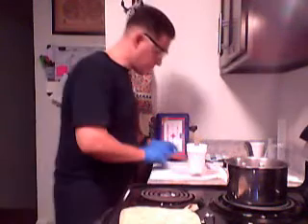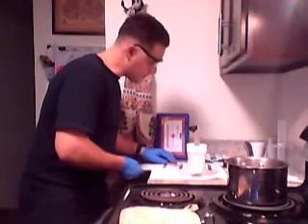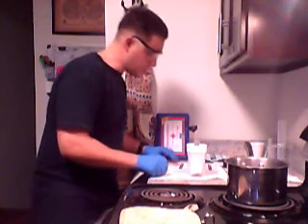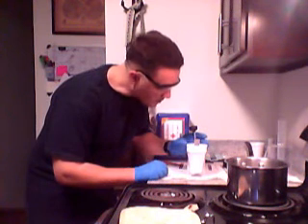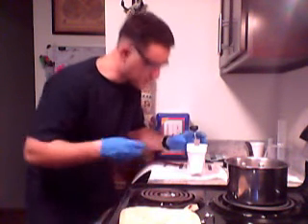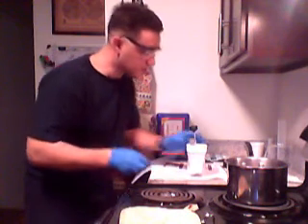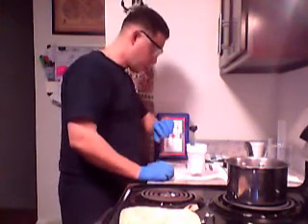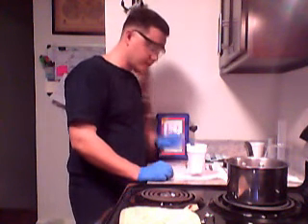Okay, in this step it also tells you to gently swirl the contents of the cup right before each recording of each temperature. So I'm just taking a look in here, making sure that my thermometer is not touching the metal, which it's not. Okay, that's good. I'm going to move this way a little bit so I can see better. Okay. And I can already see temperature going up. So we're coming up on 39 seconds here.